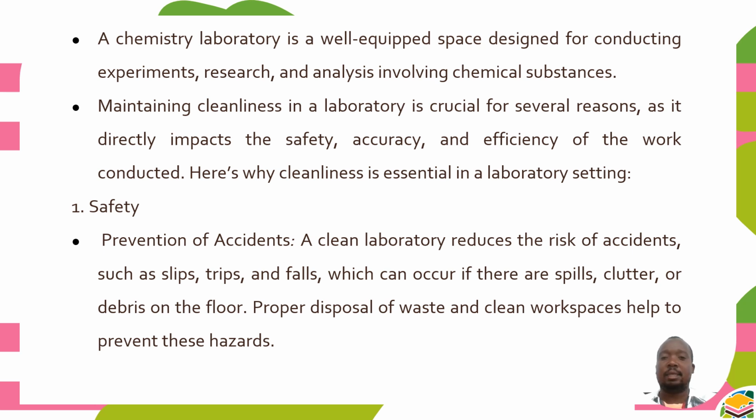A clean laboratory reduces the risk of accidents such as slips, trips, and falls, which can occur if there are spills, clutter, or debris on the floor. Proper disposal of waste and clean workspaces help to prevent these hazards. So it is for safety reasons, prevention of accidents.